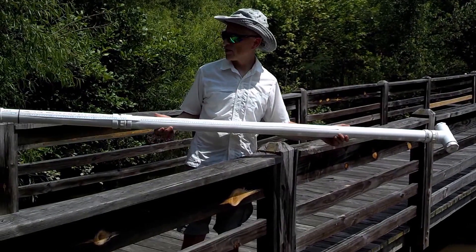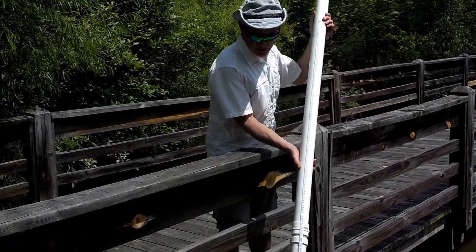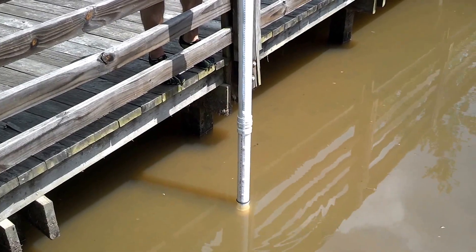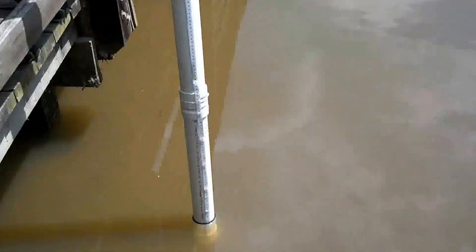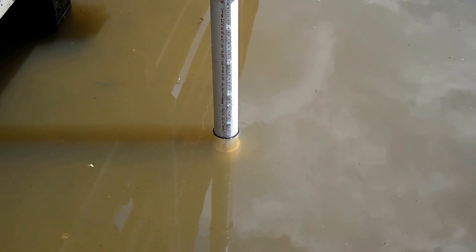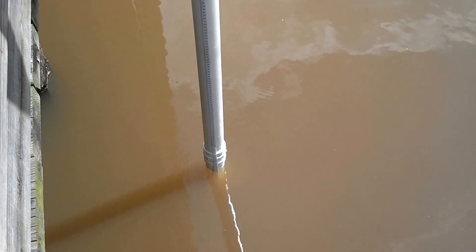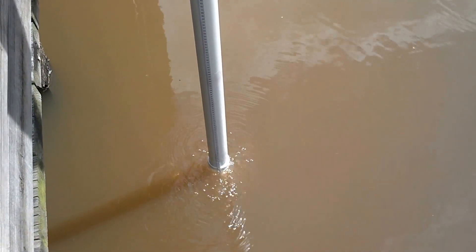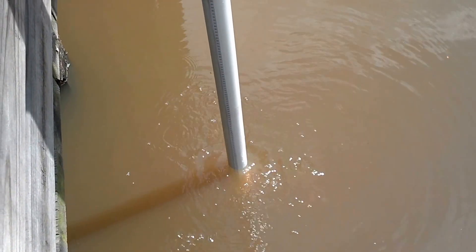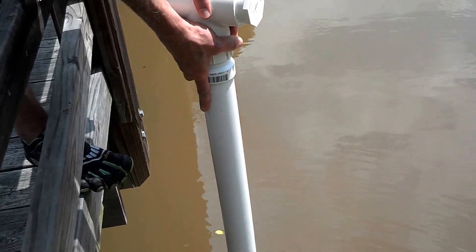Now the coring device is assembled and we're ready to start trying to get a sediment core. I'm going to place this down into the water, and as soon as I feel the tube hit the top of the sediment I'm going to make note of the depth of the water on the tape measure. As I push the core tube into the sediment I lean in and get it as deep as I possibly can.